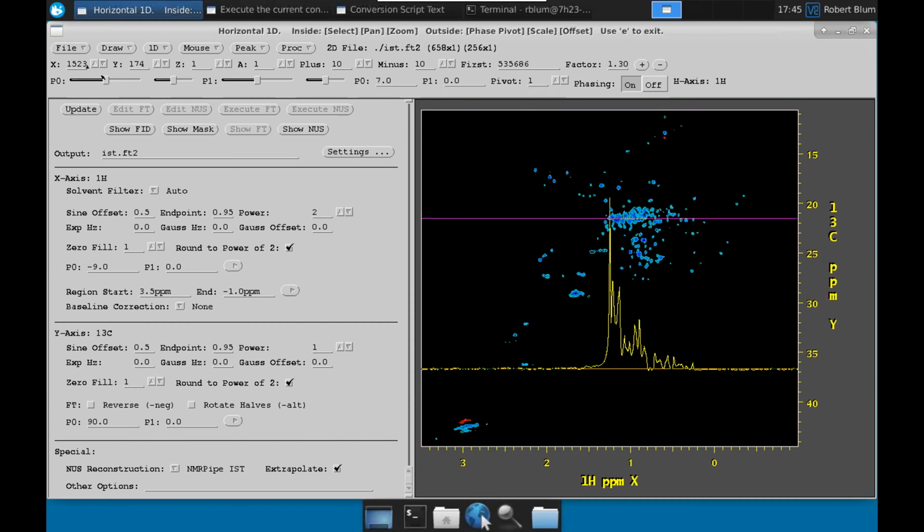Right, because I guess I'm currently snapping to -16 at the middle, although it's hard to tell because it's only 16. Right, now this is not very far from 0 anyway. This goes out to -376 as opposed to -360, or it goes to 360 minus 16. So yeah, it's giving you plus or minus 360 around the existing value. That's good. Exactly. So I think that's everything, and we're right at 5:45.